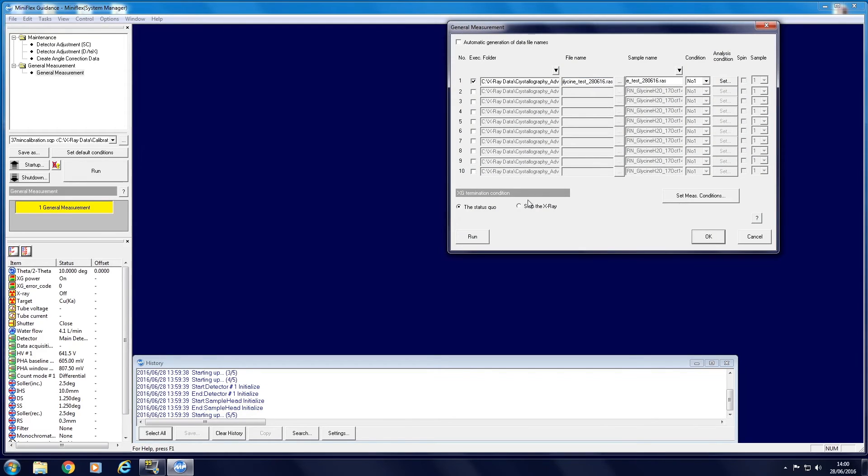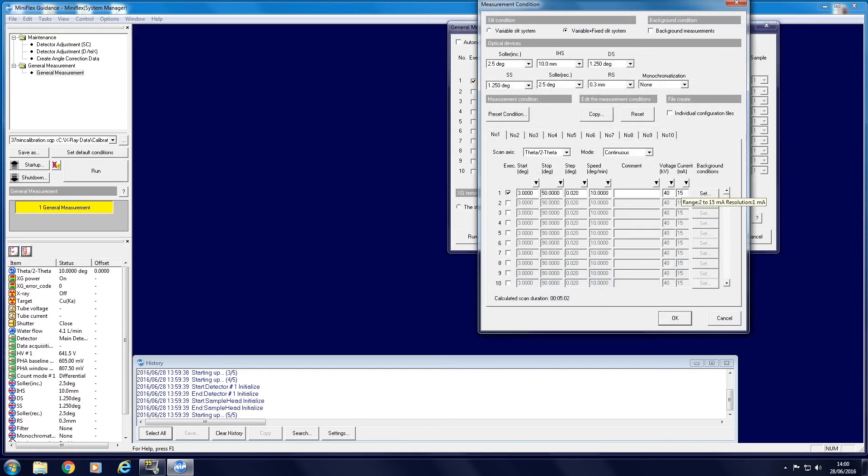After choosing name and directory, select the Stop the X-ray option and press Set Measurement Conditions. Ensure the settings are as described in your lab script, and click OK.